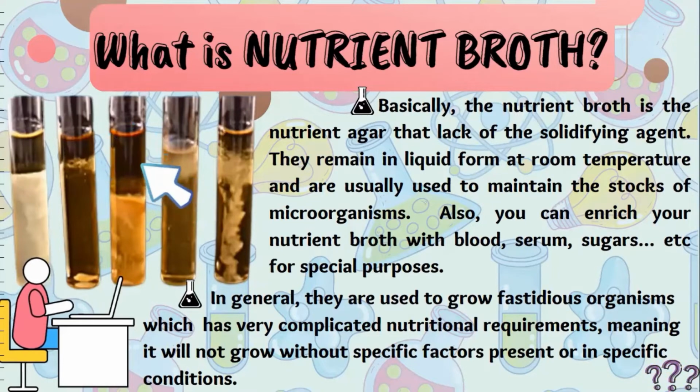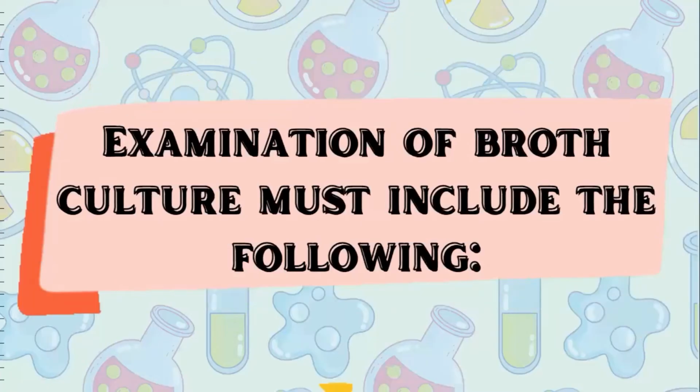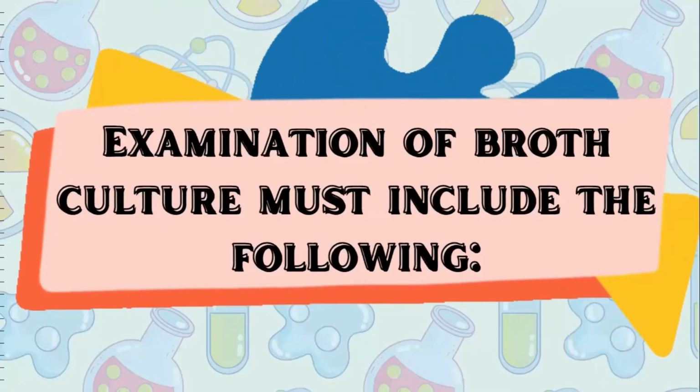In general, they are used to grow fastidious organisms, which have very complicated nutritional requirements, meaning they will not grow without specific factors present or in specific conditions. Examination of broth culture must include the following.